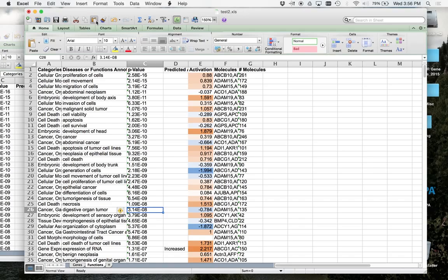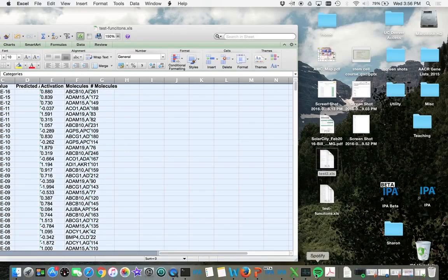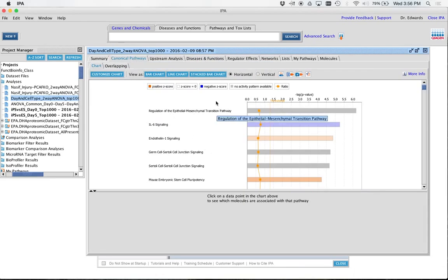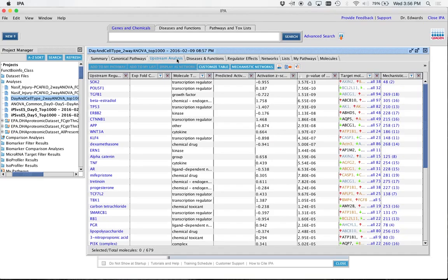Okay. And I'm not going to do this for all of them, but basically what I would do is I would go genes, functions, and I would go back to my original data set. And I would do this for canonical pathways. Export data. Then my last one is going to be upstream analysis. And actually, this is the one that I always stress when I give somebody their results. I always grab my collaborator and go, okay, this last tab is huge.